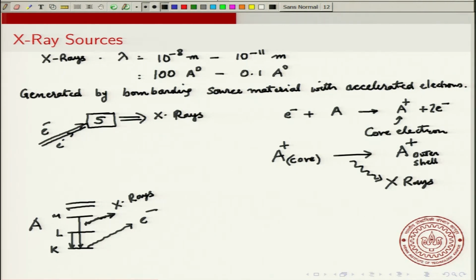The initial kinetic energy of the electrons, minus the final kinetic energy.